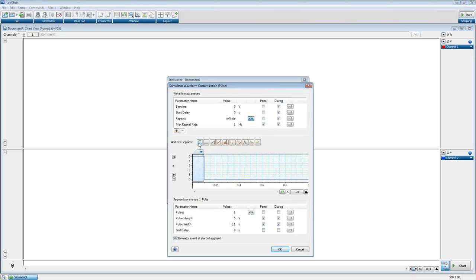The customize option. So say for here, well, I wanted more than that many pulses. Well, I can do that according to this. Say 5. What frequency do I want, or what delay do I want? We can just slowly change that. You'd have to kind of calculate here the periods if you wanted to do it this way.